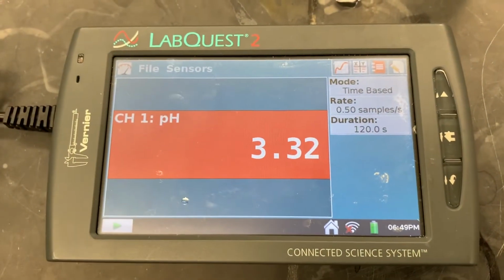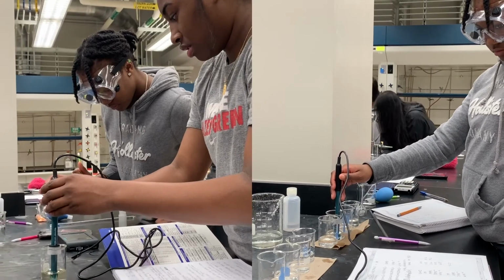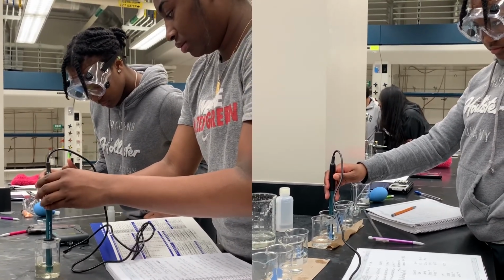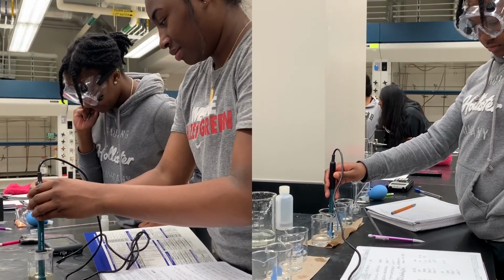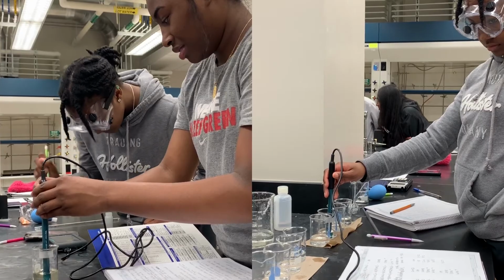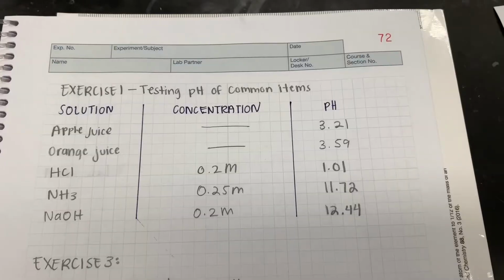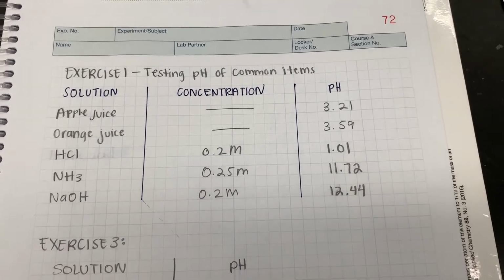After preparing our buffer solution, we were able to record its pH. We recorded all of our pH results into a data table.